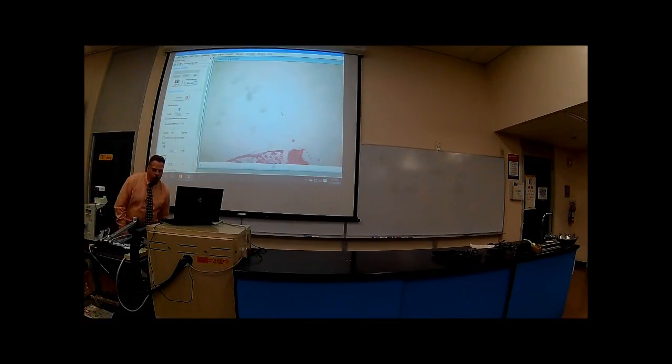The microscopy of the pulmonary system. All right, and I got 5 slides here. 2 slides on normal stuff and 3 slides on diseases. So let's just do one on the normal stuff.